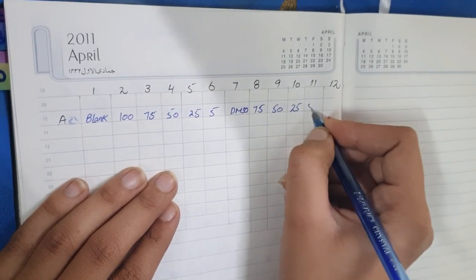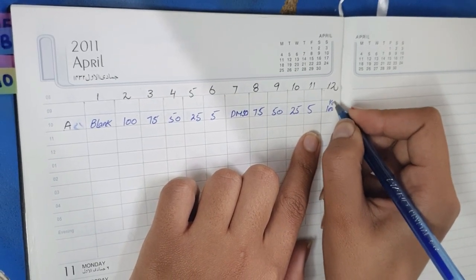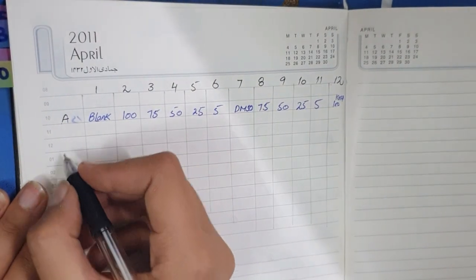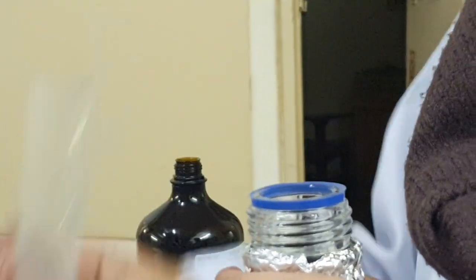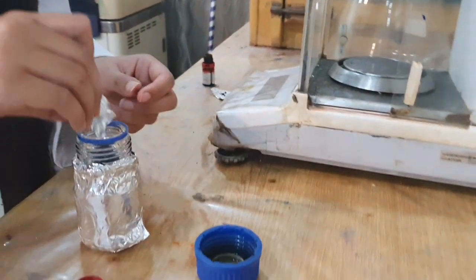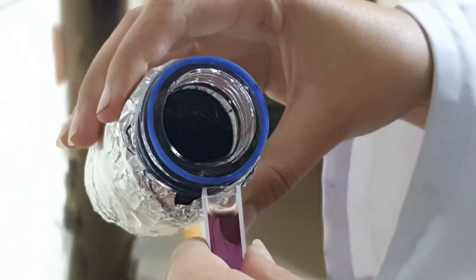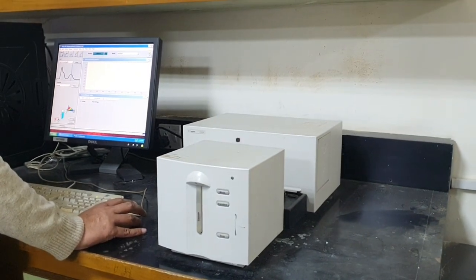So first of all, we will make a table in the notebook for numerous extract dilutions that we have chosen. Here we have chosen 5, 25, 50, 75 and 100. One will be the blank for 200 microliter DPPH, and one will be positive control and the other will be negative control. Here we are preparing the reagent by adding 1.97 mg DPPH in 50 ml methanol. Here we are trying to adjust its OD at 517 nanometer.